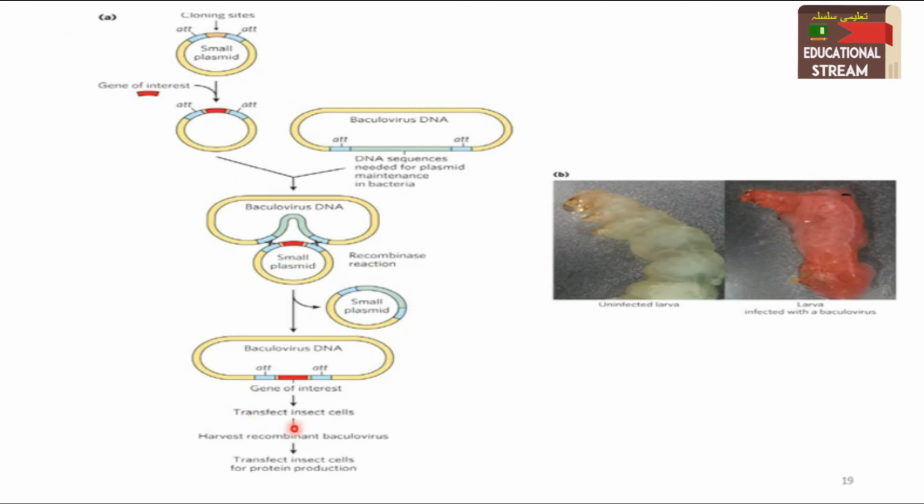Here you can see that instead of using the term transformation we are saying transfection. The term transfection is used when the DNA which is used for transformation includes viral sequences and leads towards viral replication. Then we call it transfection rather than transformation.